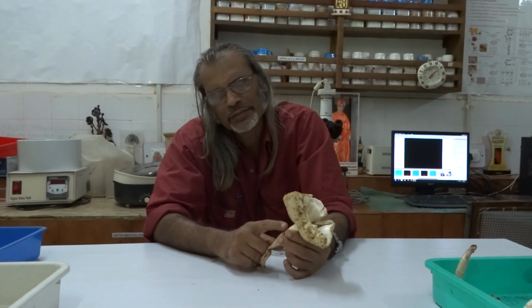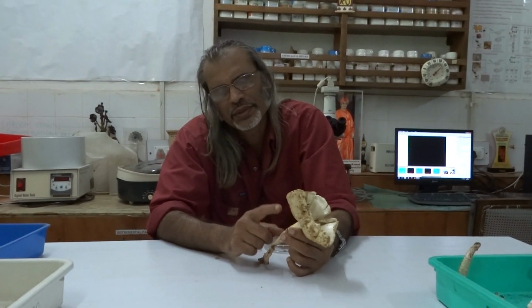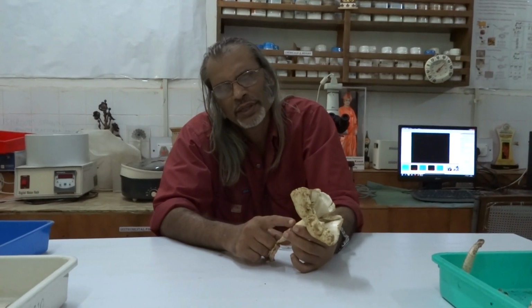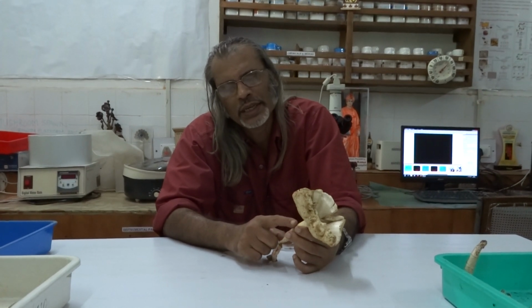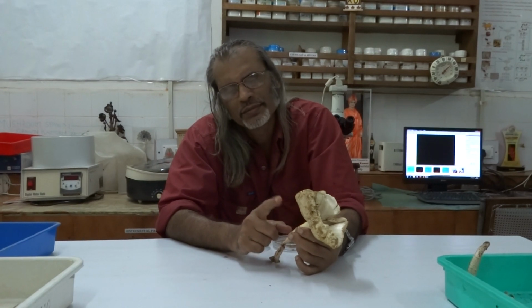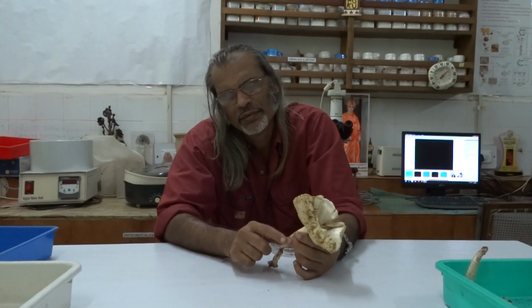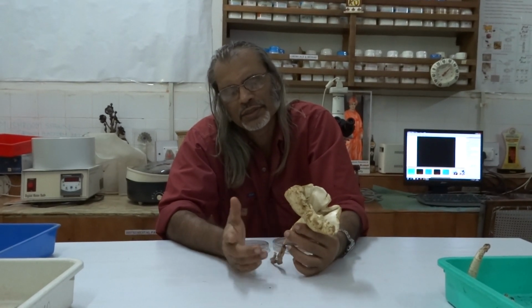Then we have to look at the sterile elements like cystidia, their shapes, their size, their distribution, their polymorphy. Then we have to look very carefully at the type of basidia and ensure that they are all normal, tetrasporate with long sterigma.